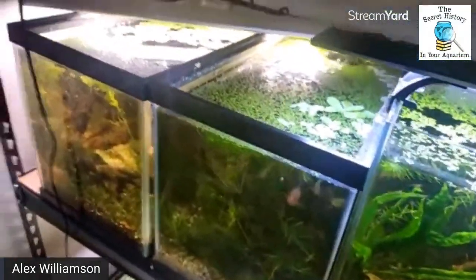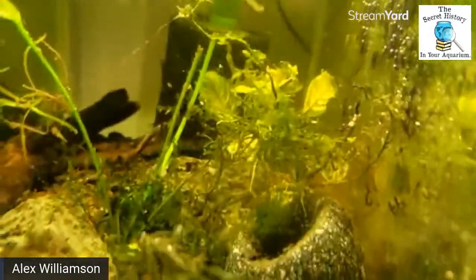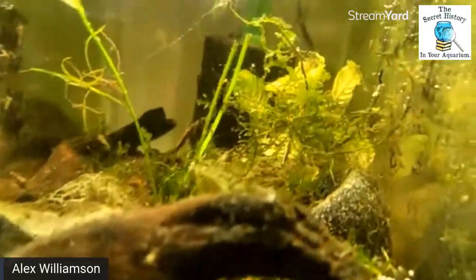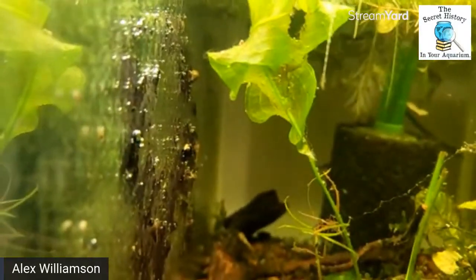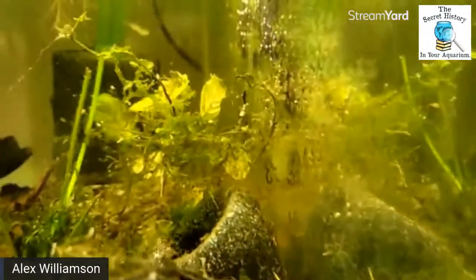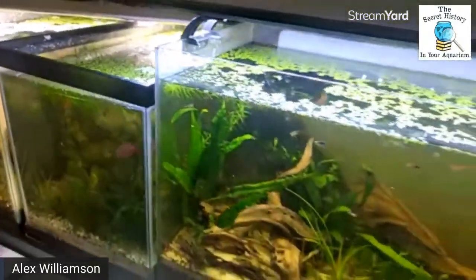The other thing that I was kind of curious to check out was this tank, which is where all the little baby, where are they all? Oh, they're up there. Where all the little baby fish from the Turkana jewel cichlids have been hanging out. And they've been feeding off this wall, these dirty, dirty walls. And there looks like cyanobacteria and stuff. So I'm kind of curious. But let's do the planted tank first, and then we'll come back, and we're going to see what these little fish are eating off the side of the walls, because they just sit there all day and pick at the walls. So we'll see. And I haven't purposefully put any cultures in that tank. It's just whatever appeared in the tank.